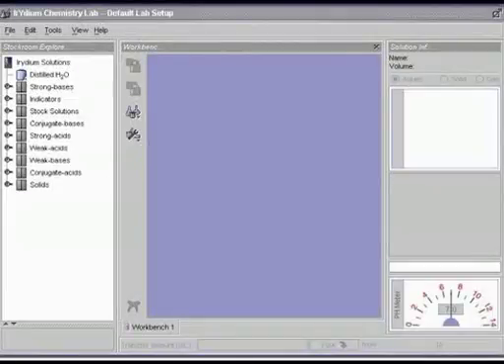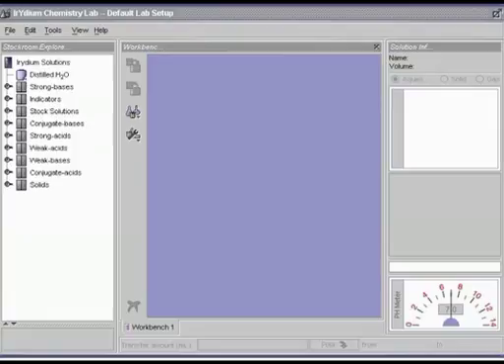How to use the virtual lab. This activity uses the virtual lab, or V-Lab. We will now explain its features and how to use it to answer a chemistry question.